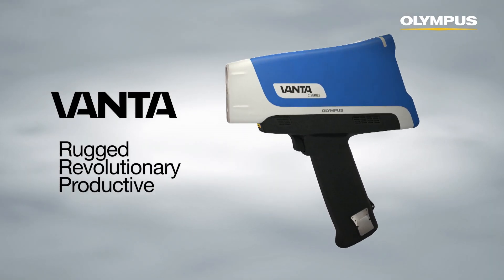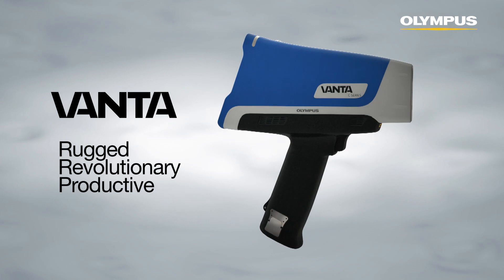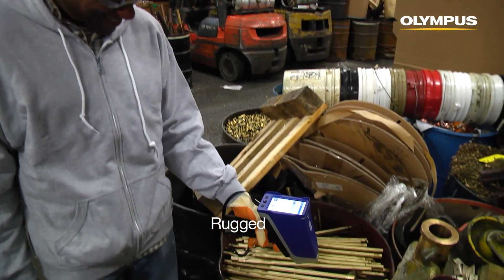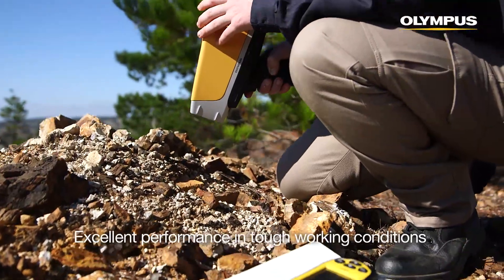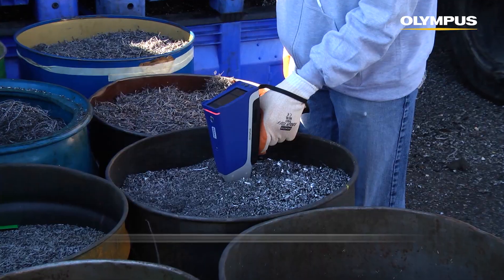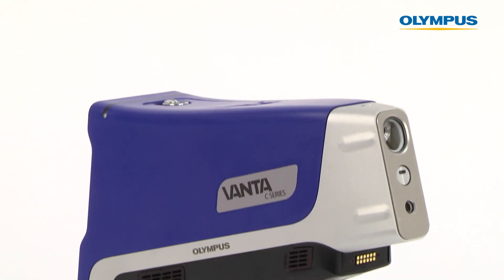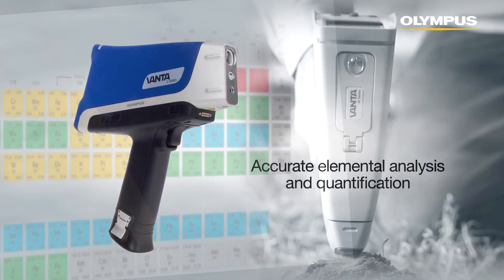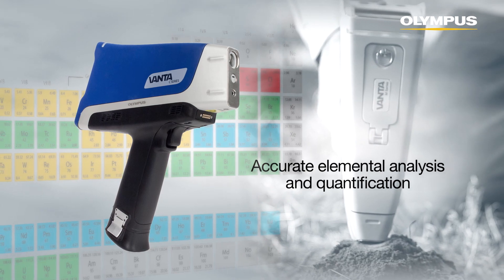This video will introduce you to the Vanta, the latest generation of Olympus handheld x-ray fluorescence analyzers. Vanta analyzers are rugged, revolutionary, and productive. They deliver the right answer in the toughest working conditions for maximum uptime and a low cost of ownership. Vanta analyzers provide accurate elemental analysis and quantification for a wide variety of materials in as little as one to two seconds.